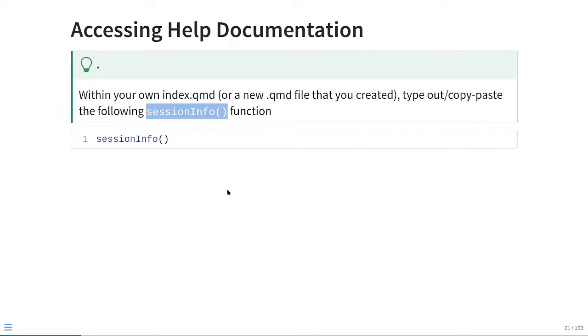And for this course, as you're copying and pasting back from the website, if you hover over a code block chunk, what you'll end up seeing is something that looks kind of like this, where there'll be a little copy sign that will let you work with it. There'll be a little section where you can copy and paste it back, and this helps you prevent having to retype very long sections of code or accidentally mistyping something. So it just makes your life a little bit easier across the board.